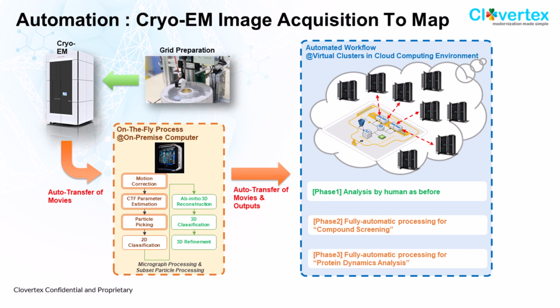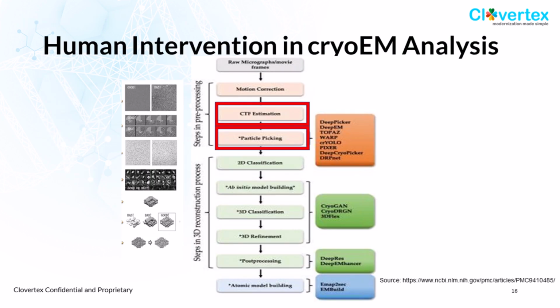Next, please. Yeah, thank you, Satoshi-san. I just wanted to point out a couple of things here. The amount of data and the amount of compute needed for doing this analysis is really high. Typically, a sample produces 3 to 7 terabytes of data. It needs GPU and CPU compute. And so having access to the storage and the compute, cloud is a very good environment to run this analysis on. Right. Thank you very much, Devin.